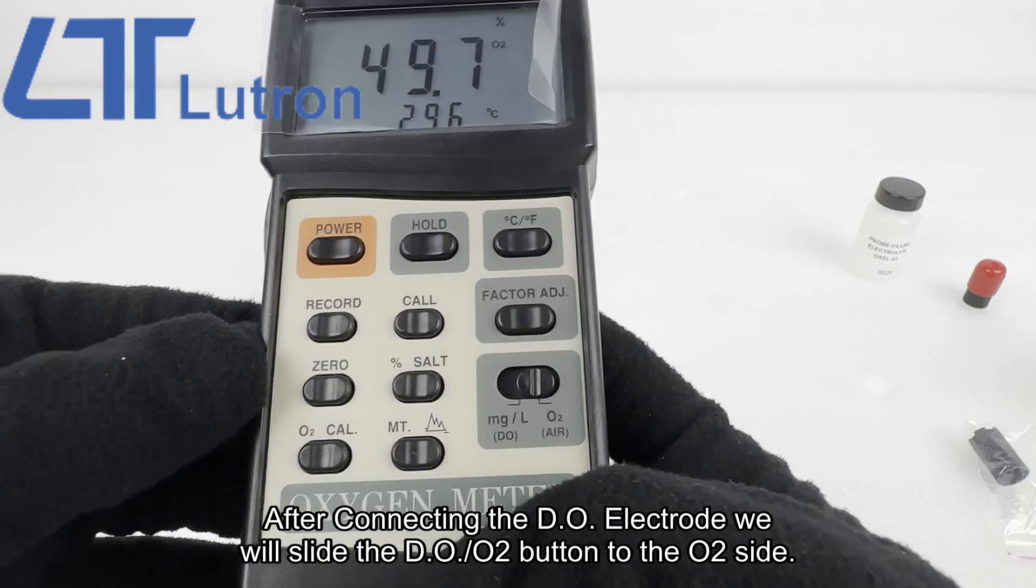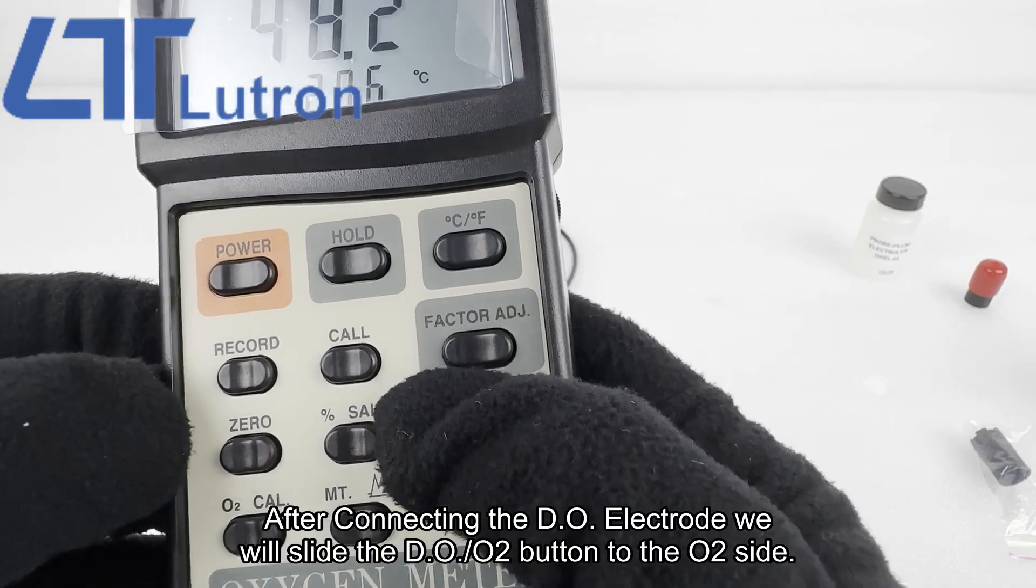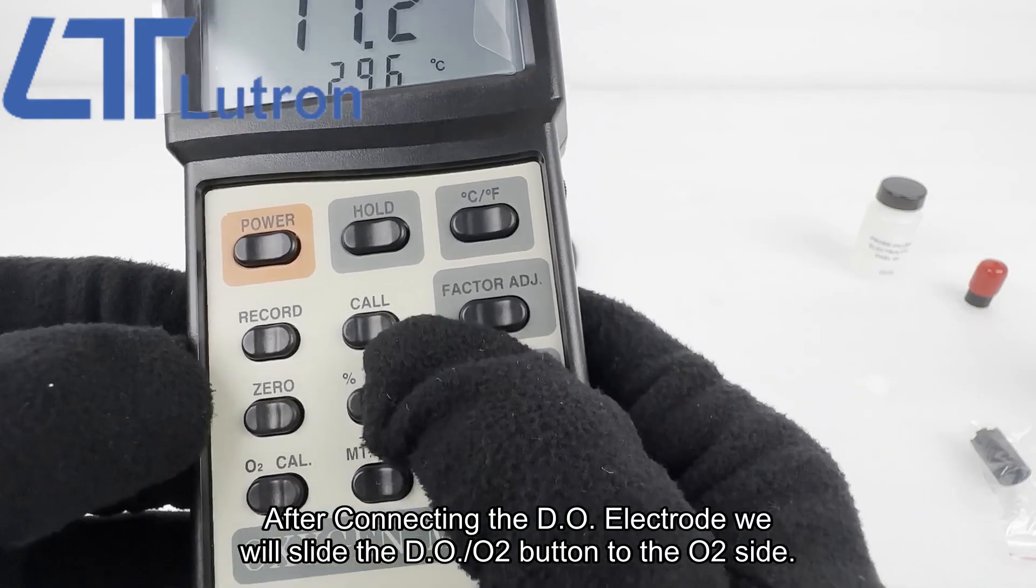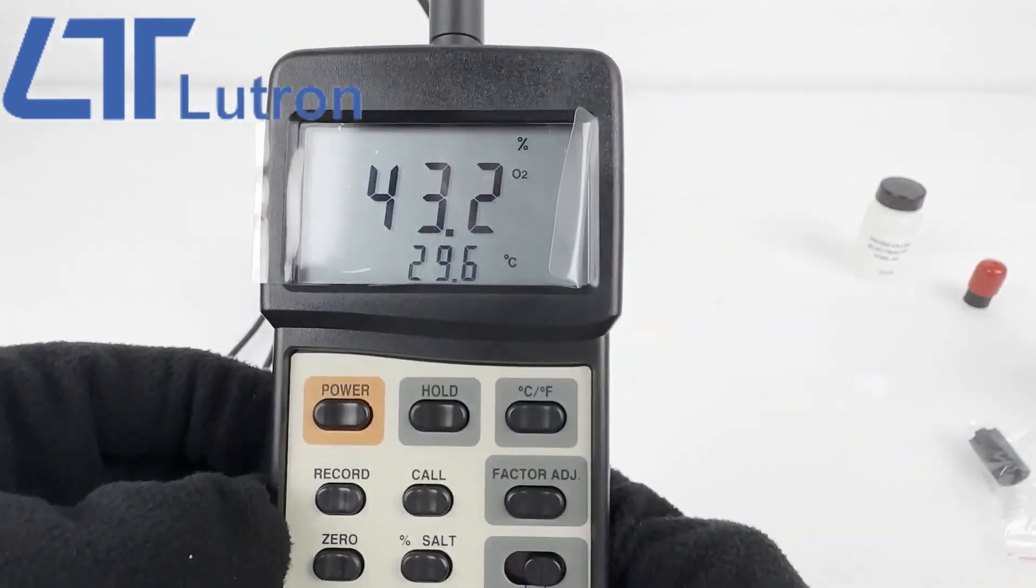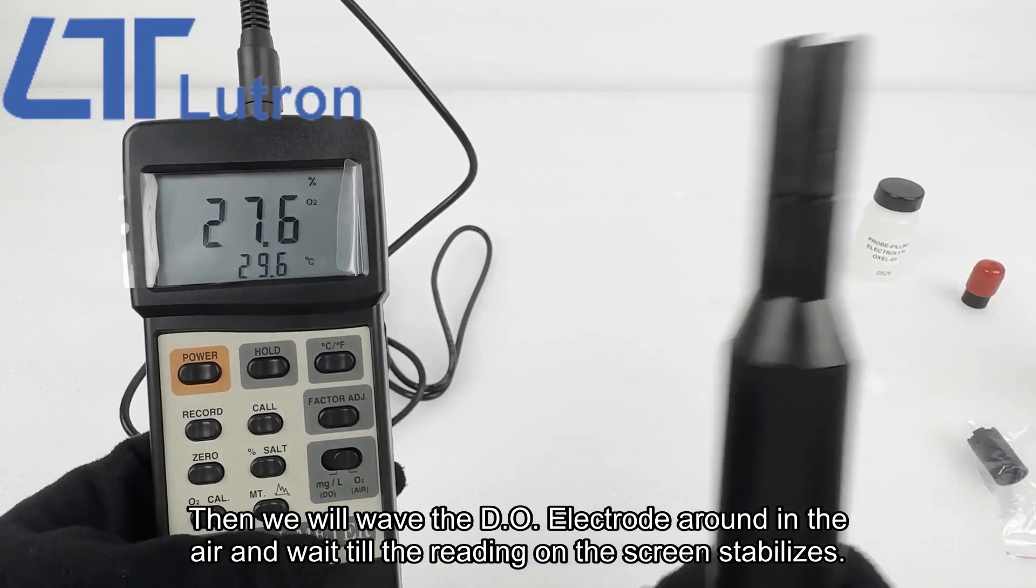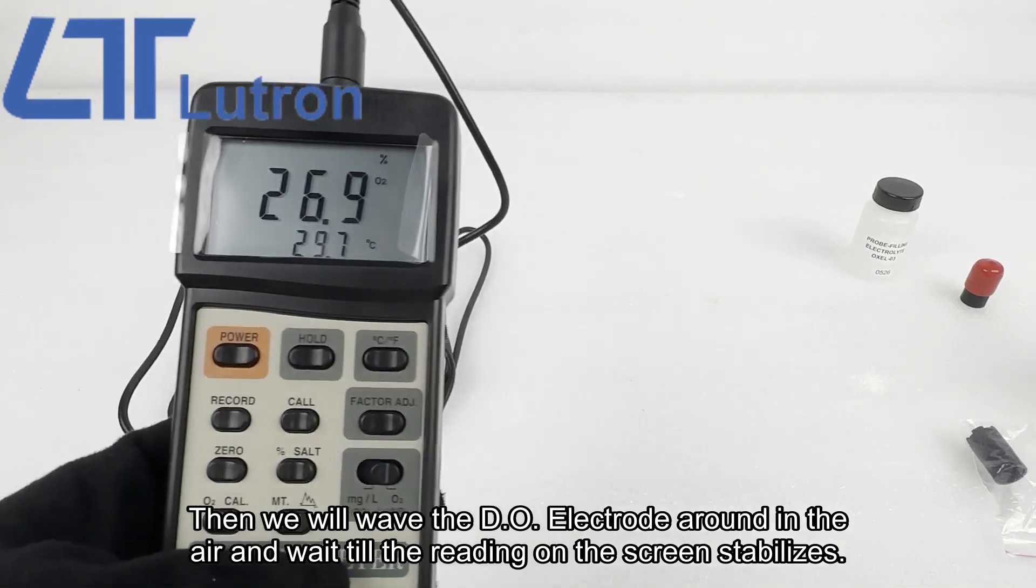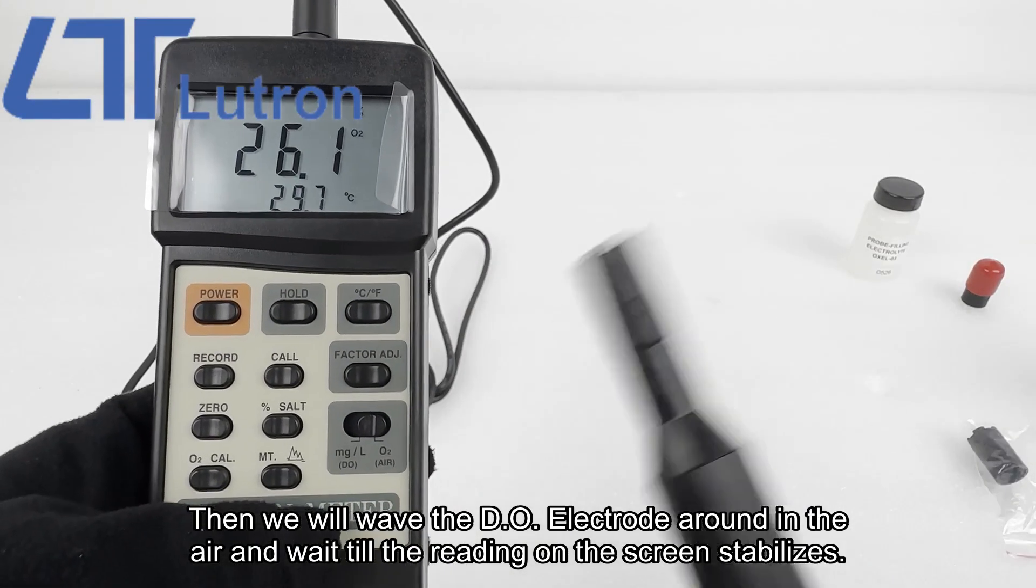After connecting the DO electrode, we will slide the DO O2 button to the O2 side. Then we will wave the DO electrode around in the air and wait till the reading on the screen stabilizes.